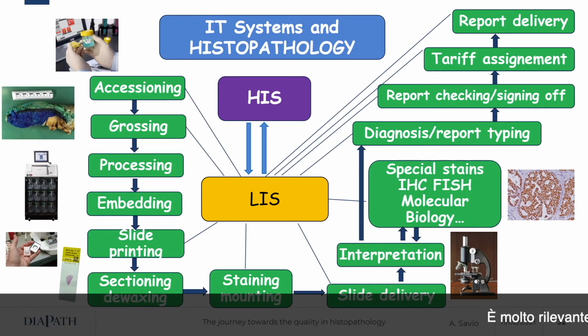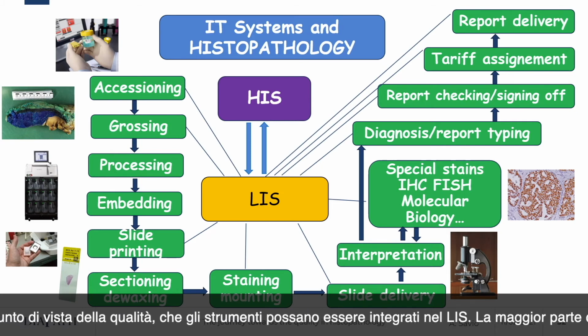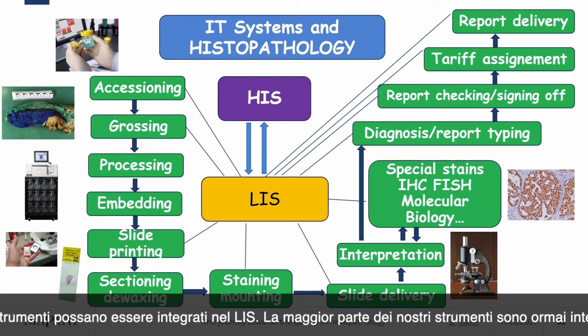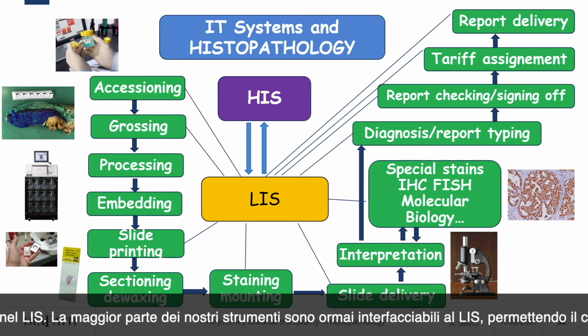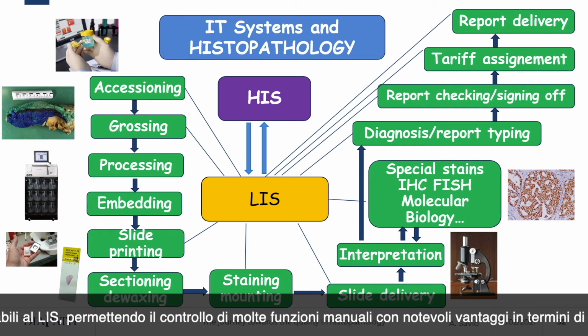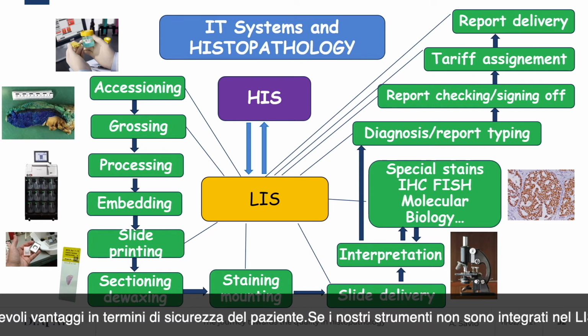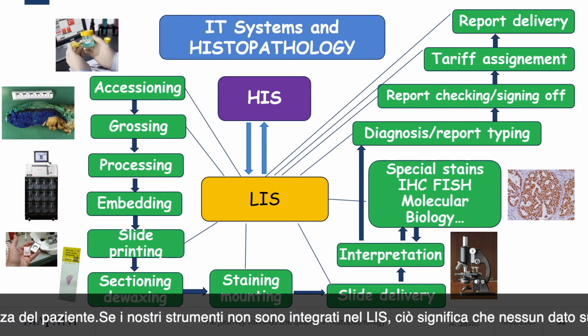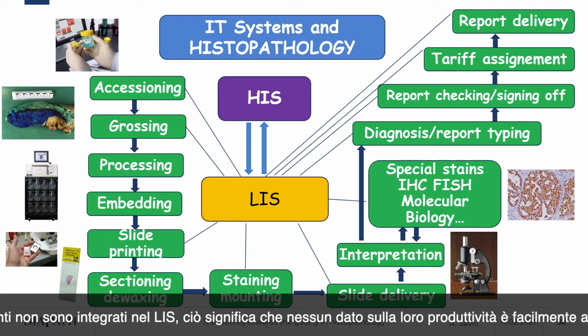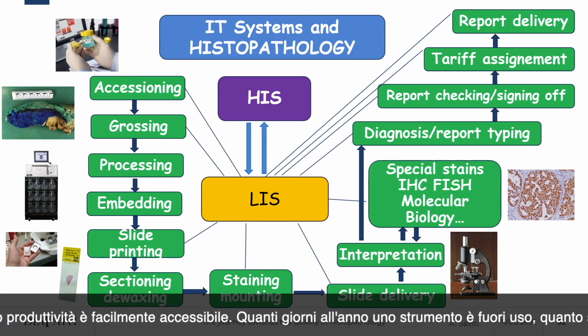It is highly relevant from the point of view of quality that our instruments can be integrated into the LIS. Most of our instruments now have become interfaceable to the LIS, allowing the control of many manual functions with considerable advantages in terms of patient safety. If our instruments are not integrated into the LIS, this means that no data about their productivity is easily accessible.